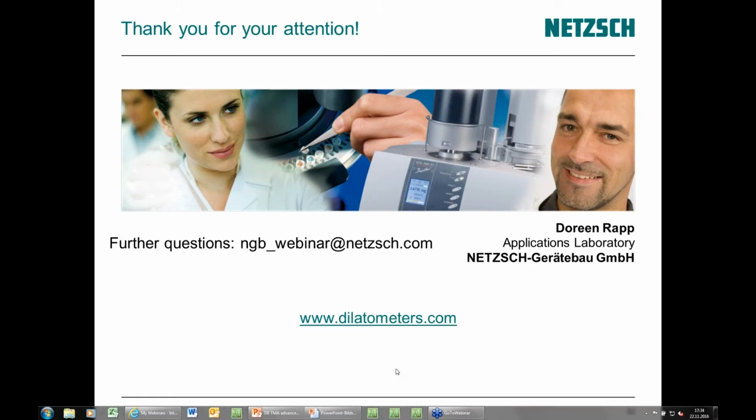One question regarding sintering studies. So using RCS, I cannot say that isomode is the best for all samples, because in our case we got better results using isomode in comparison to start-stop mode, but this might be also different for other materials. So here you usually start performing a first measurement with a constant heating rate to get information about the sintering rate and the maximum sintering rate, and then you can go on and test with ISO mode and also with start-stop mode.